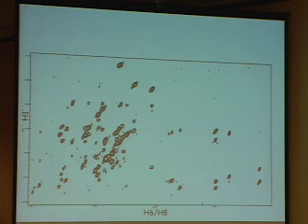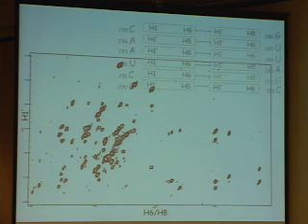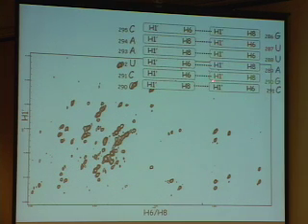So the NOESY spectrum shown here, on the horizontal axis we have our H6 and H8 proton frequencies, and on a vertical axis we have our H1 prime proton frequencies. In reality we have other frequencies, but this is just to go with the simplified secondary structure. So as I mentioned in the previous slide, H1 prime and H8 of G290 shown in interaction. So it's known to show an interaction at this point here.